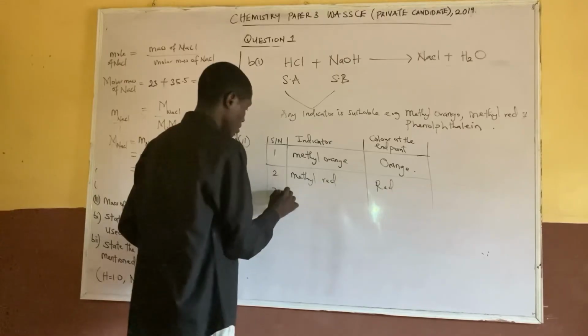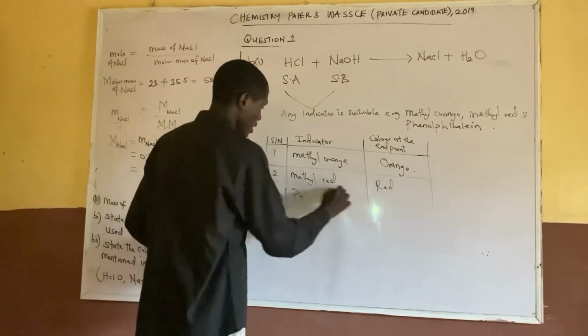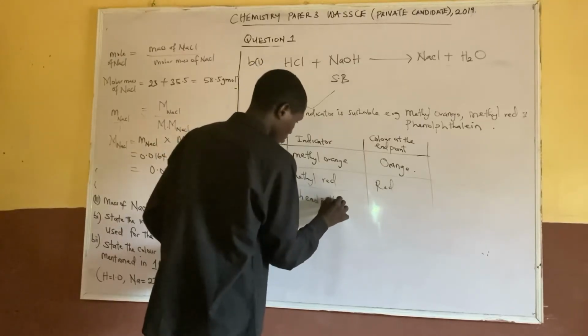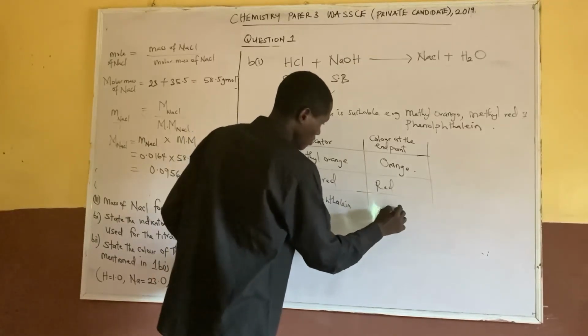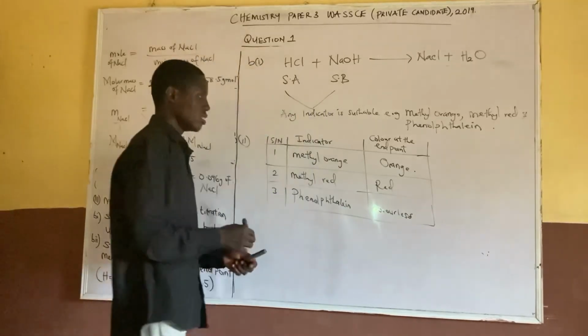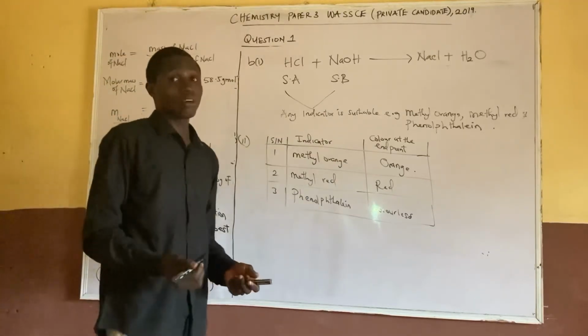And phenolphthalein, colorless. It's as if the color at the end point is the same as the color of the indicator given to you.